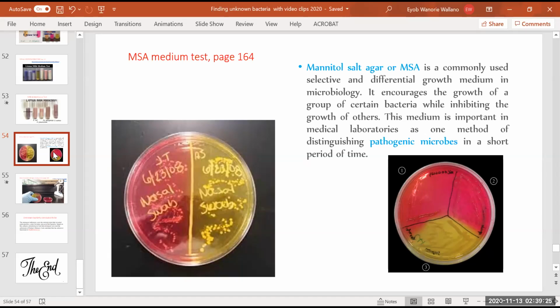Secondly, when we were using certain media, staphylococcus is going to show you the positive reaction, and then streptococcus, no catalase reaction. Number two. And then number three, you are going to identify staphylococcus and streptococcus in a third stage.